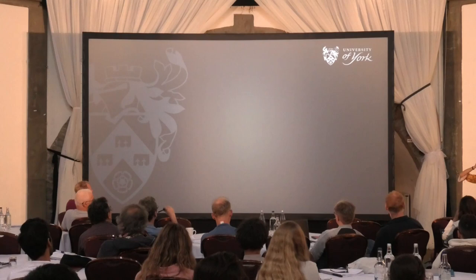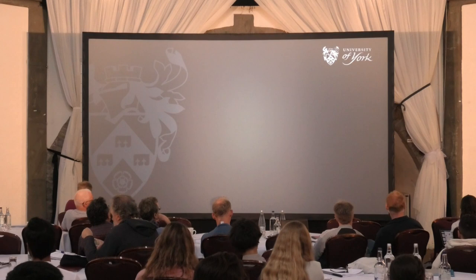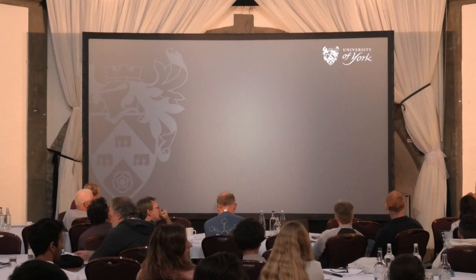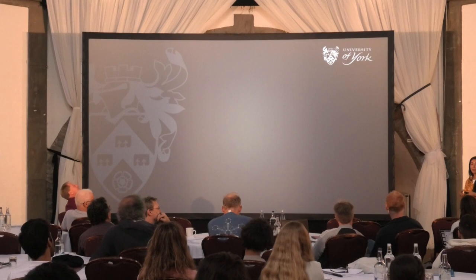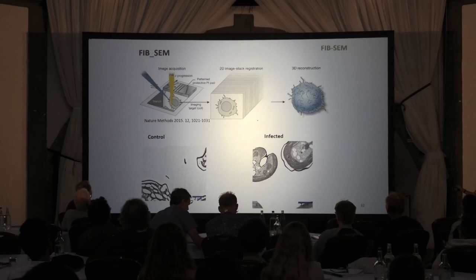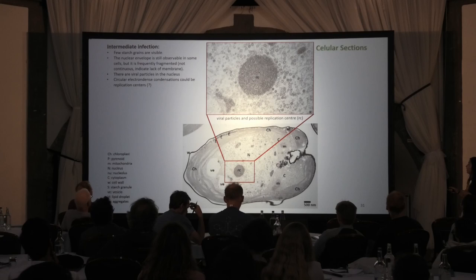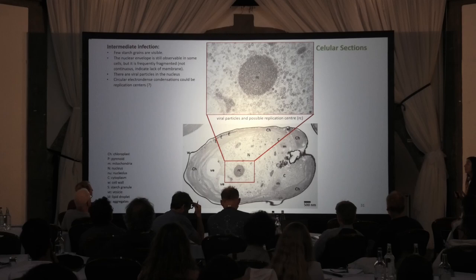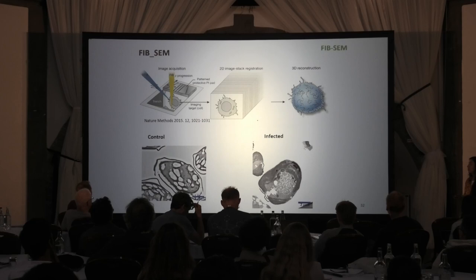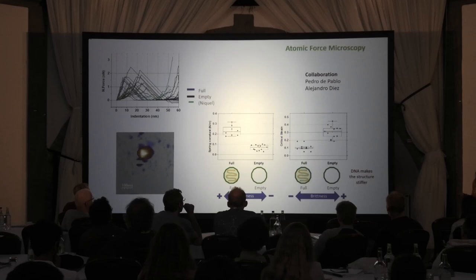We are working on several sections, and we are also preparing some reconstruction of the cell using a system. We try to analyze the particles contained in the nucleus because this virus assembles inside of the nucleus like adenovirus. When we look at the structure of the virus, this one, it looks like the capsid follows the construction assembly like adenovirus, but this is only a preliminary study. We will try to check the structure in more detail using this technique and also lamellas in the picture. And we are also collaborating with Pedro de Pablo to analyze the mechanical properties of this virus.